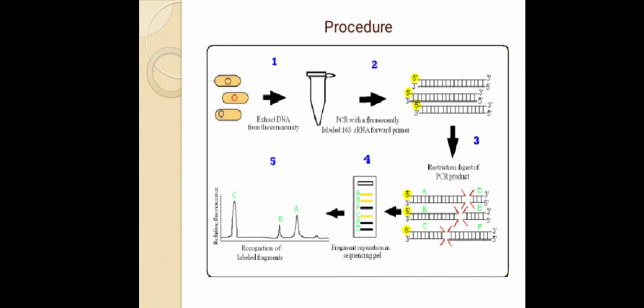We can use the radioisotope, or follow other techniques such as tagging with a fluorescent compound, or blotting techniques. All these techniques will help to find out where the DNA is located in the gel and the gel ladder appearance.